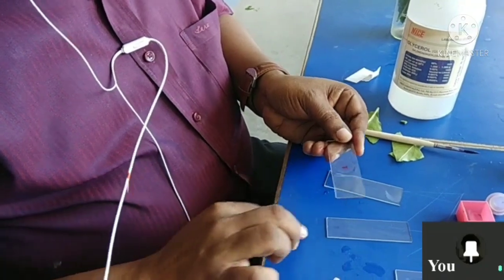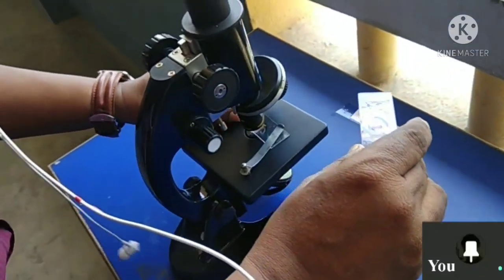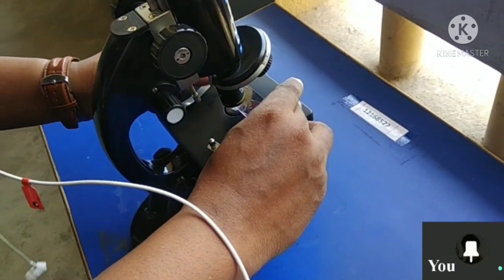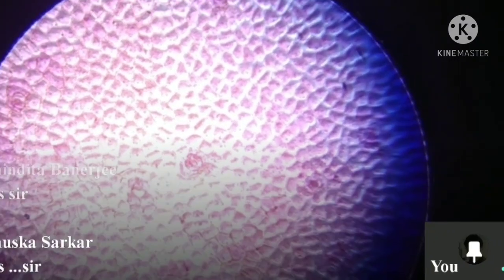Now it is fixed, and now it is ready for viewing under the microscope. Under the microscope you can see now — can you see some structures which are very clear?